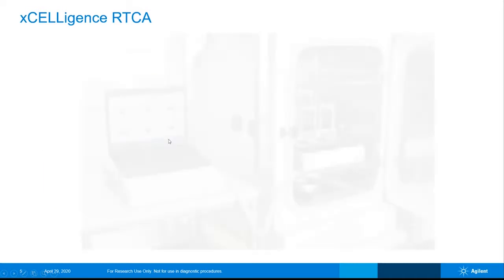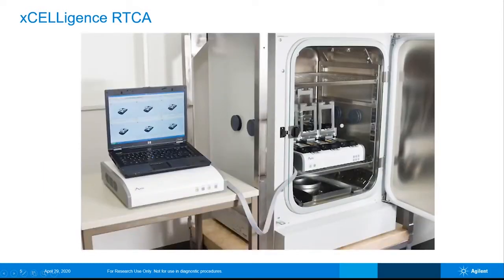The plate gets put inside the xCELLigence instrument, which is housed inside a regular tissue culture incubator. So you're going to control temperature, humidity, and atmospheric composition as you would in any other experiment. The xCELLigence instrument then interfaces with a control unit that sits outside the incubator. This computer runs the xCELLigence software. So this is where you program the details of data acquisition. It's also where you can watch in real time your data being collected. It also includes a suite of analysis tools that can be used for producing quantitative information from the time data.